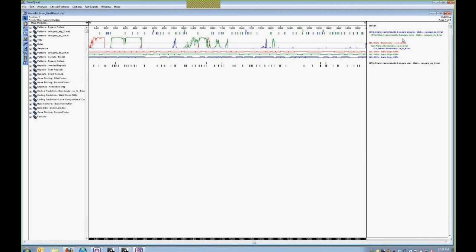What we have here are a list of acceptor sites and donor sites, as well as Borodovsky matrices. And for those of you who aren't familiar with Borodovsky plots, these plots are used to evaluate coding potential independent of identifying open reading frames. So combining Borodovsky plots along with open reading frames gives you a very accurate way of identifying potential coding regions.